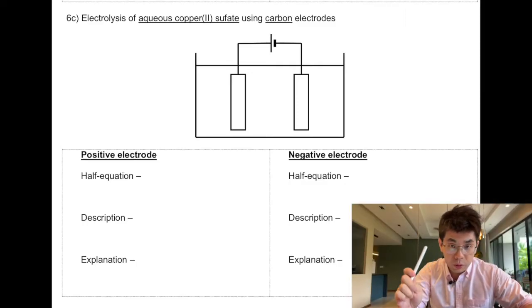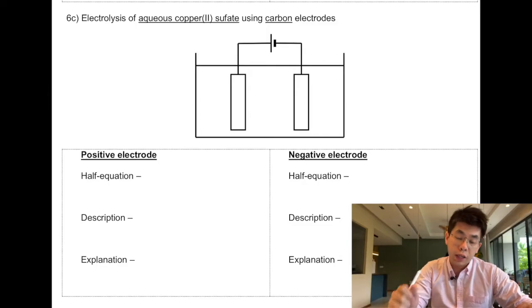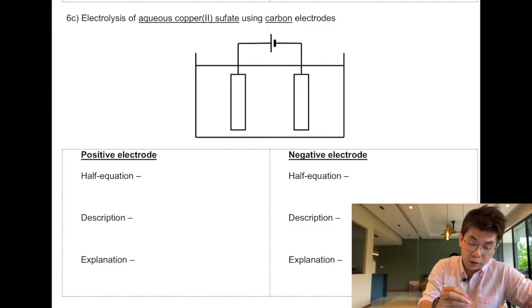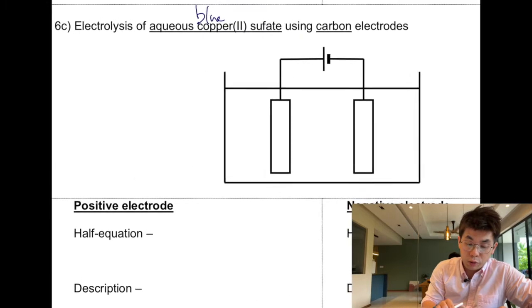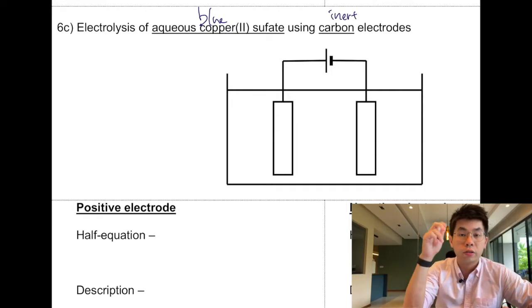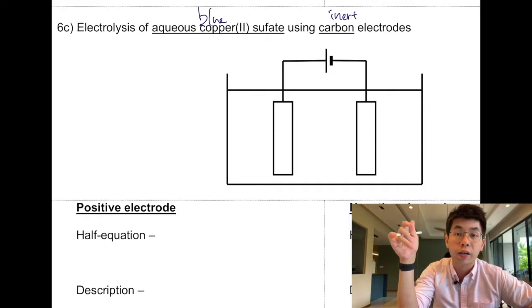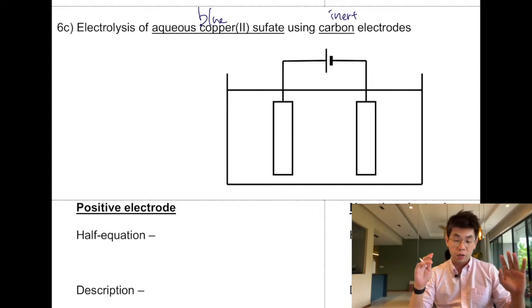Today we'll be doing another electrolysis example, this time with aqueous copper(II) sulfate. Aqueous copper(II) sulfate is blue in color. I'm using inert electrodes here, which means the electrodes conduct electricity but do not react with the solution.